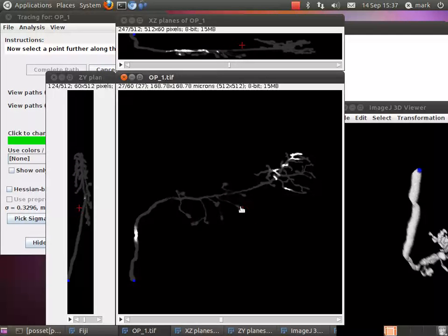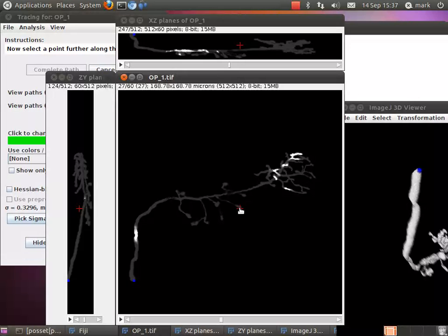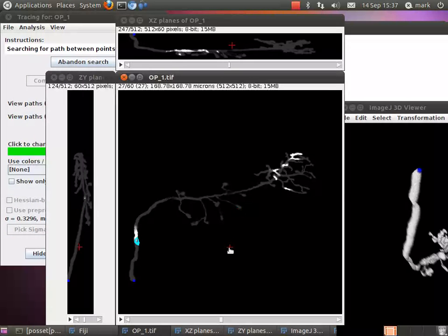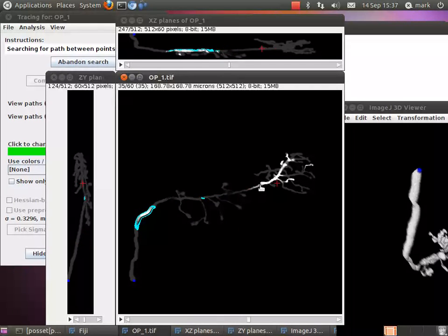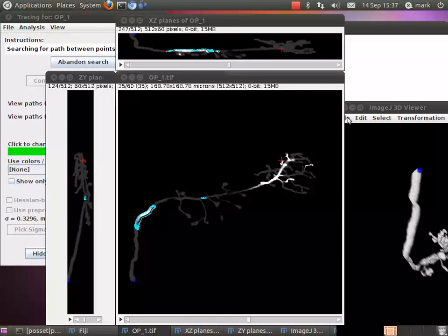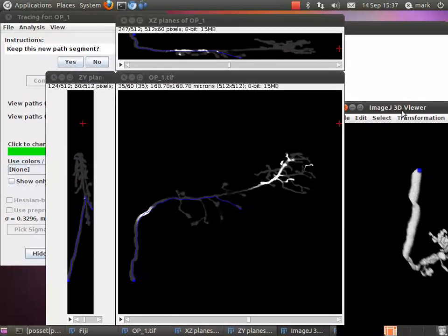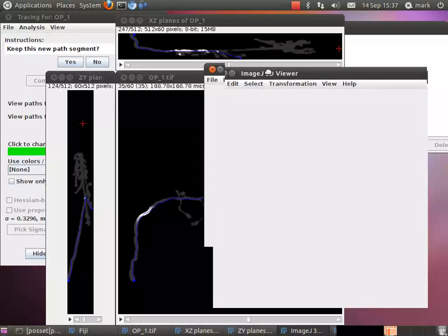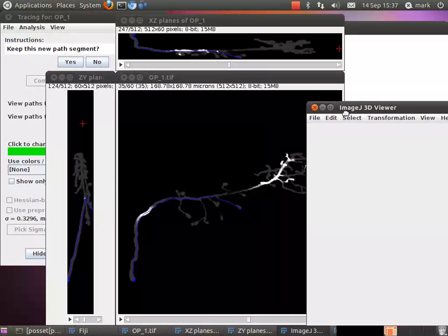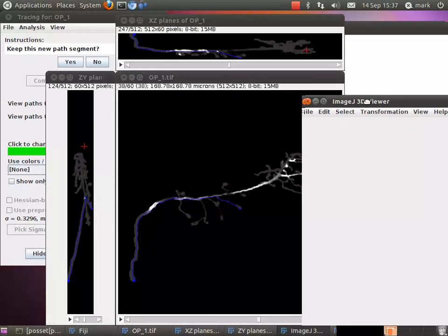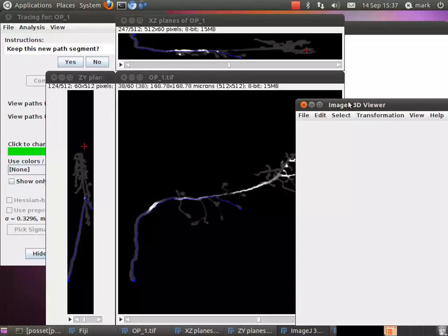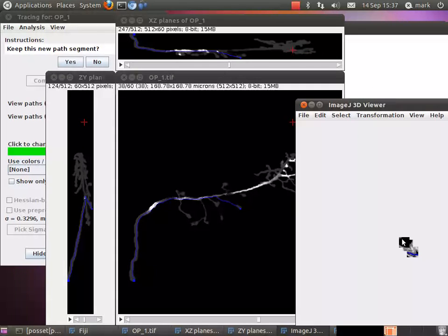So for instance, if I want to trace out to this terminal here, I can just press M with the mouse over there, and after a bit of searching, we should see the complete traced process there. Not sure why the 3D viewer stopped displaying that now, but ah, there we are.